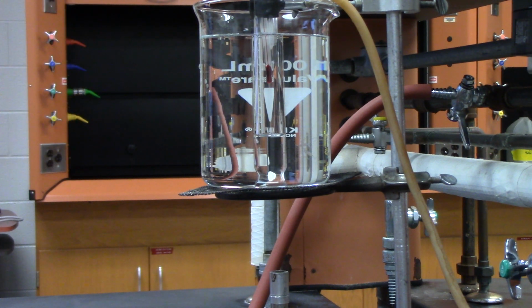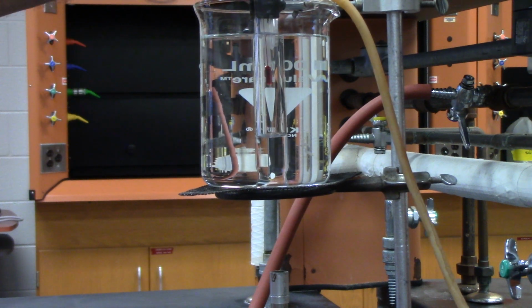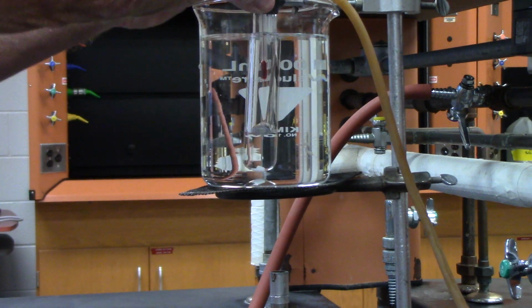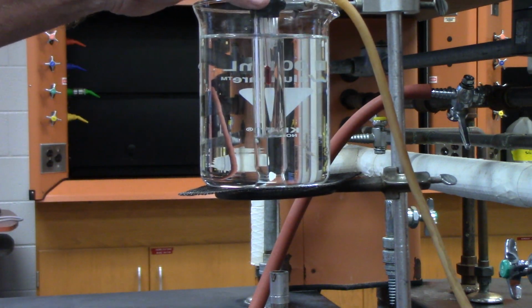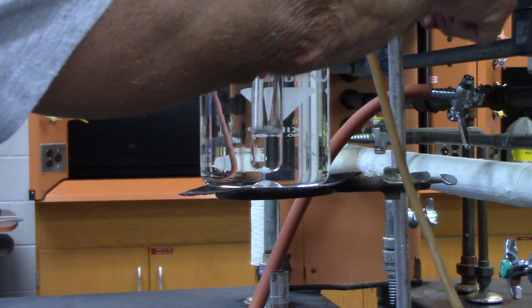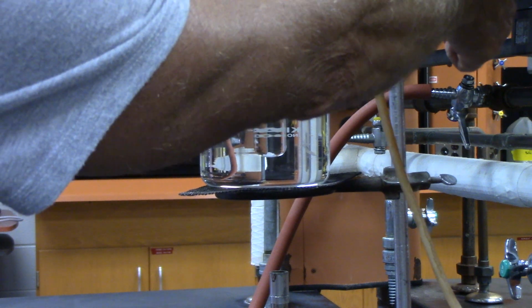Now, the possible temperatures it could go up to from our knowns are between 40 degrees Celsius and 85 degrees Celsius. 40 degrees Celsius is about 100 degrees Fahrenheit, and 80 degrees is about 185 degrees. So the water won't boil, because water boils at 100 degrees Celsius.